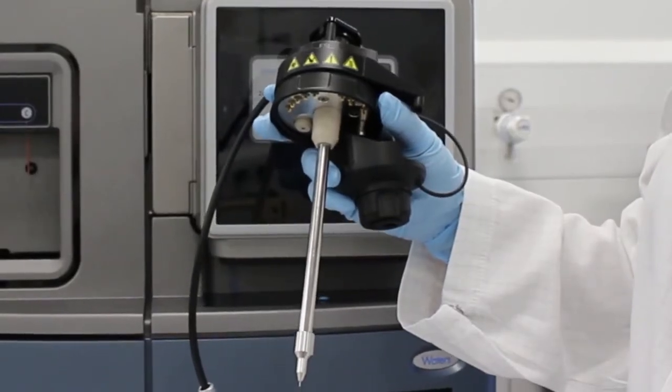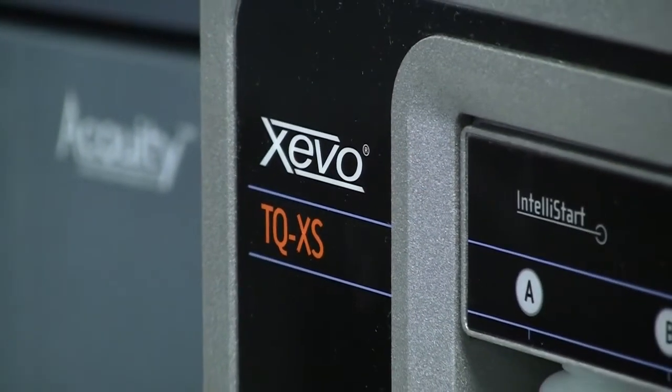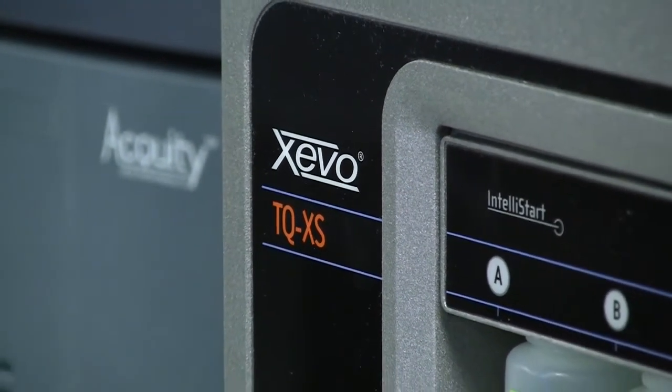This video shows the ESI variant being installed on the Xevo TQ-XS mass spectrometer.